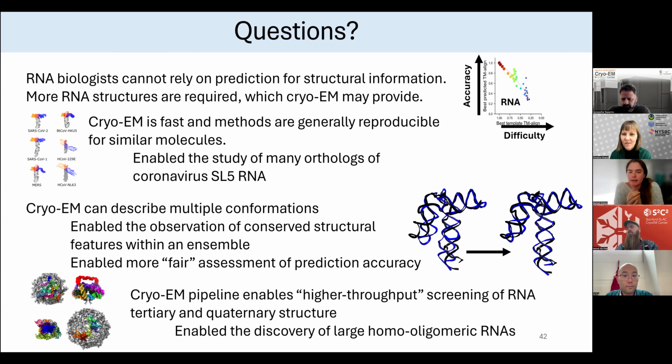Similar for the OLE. So while we did not solve it with proteins, protein binding domains that were known are solvent exposed, and it's very obvious where the proteins are supposed to go. So because of that, now we can start generating hypotheses on how the proteins are orientated to each other and how they may be interacting, for example. But again, it did not lead to any clear functional information without doing further biochemistry that we have not done ourselves yet.